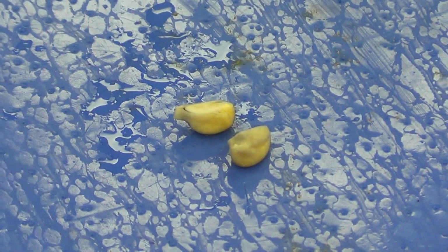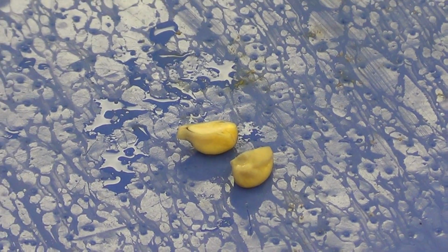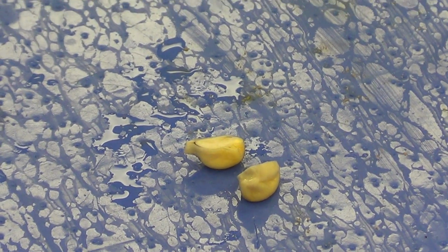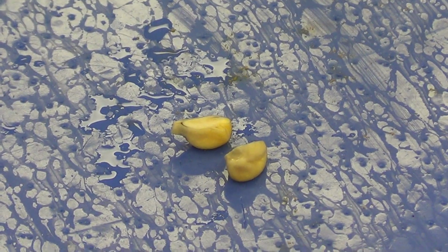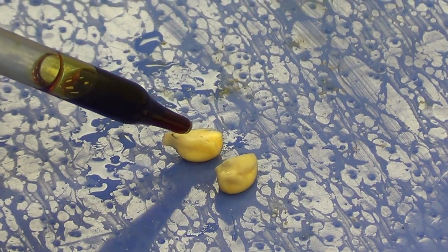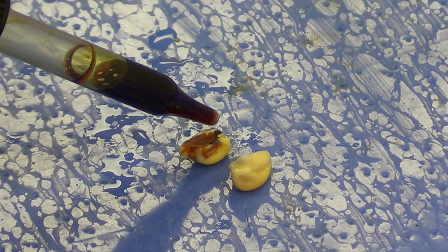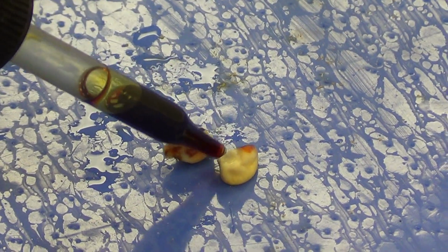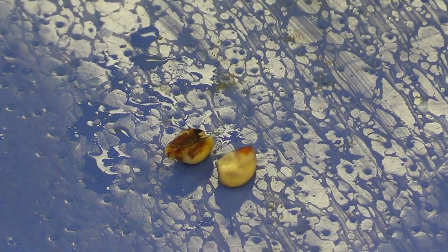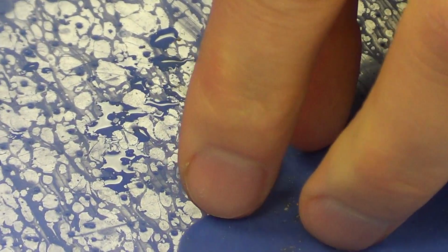The next thing I'm going to do is put a little bit of Lugol's iodine on it, just a very light coating to sort of bring out some of the structures. So a very light coating. And I'll put just a little bit on the other half of this. I'm going to let that soak in for just a second.